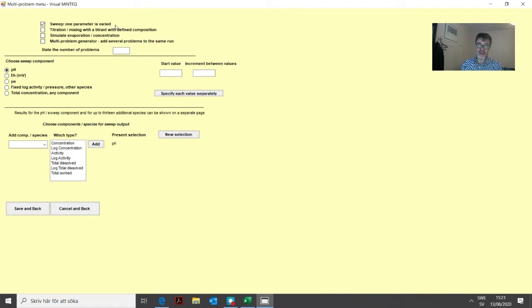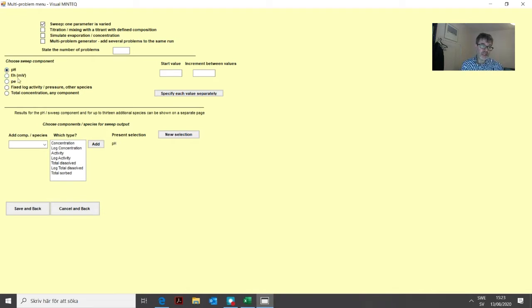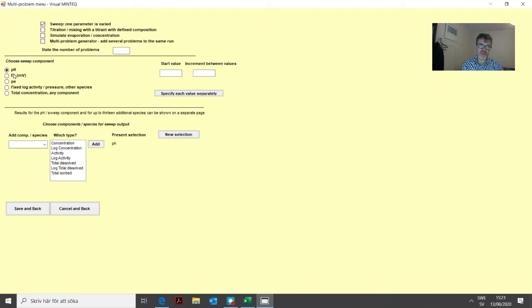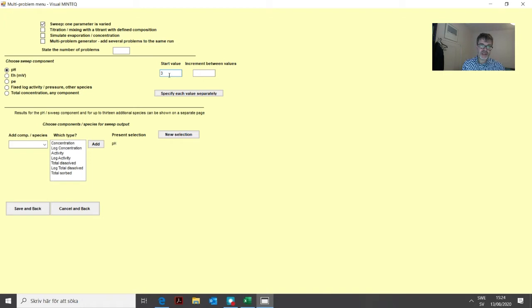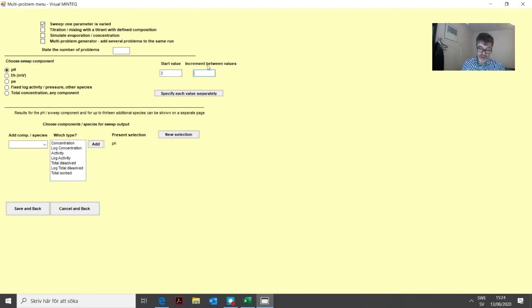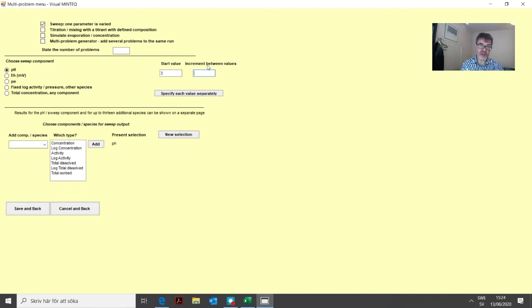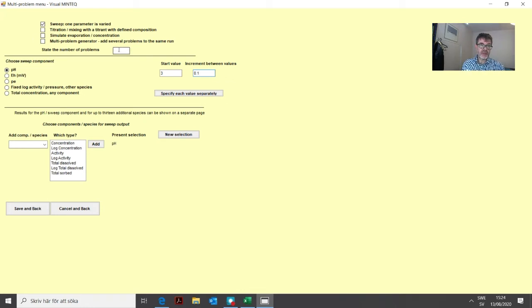The parameter that is varied is the pH, which is the default option. You can also have other things as a sweep component. We have some text boxes to fill in. The start value is pH 3. Then let's assume we have a 0.1 step between each pH value, which generally works well and gives us a nice graph in the output.